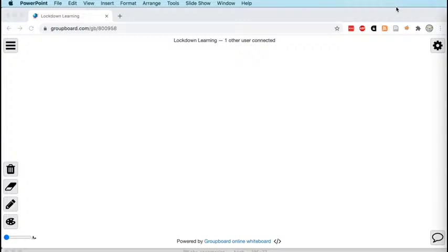So in a real experiment, you've got many more than just 2 reads. You have lots and lots of reads, usually hundreds of thousands or millions. The overlaps between each of those reads is not going to be the same.